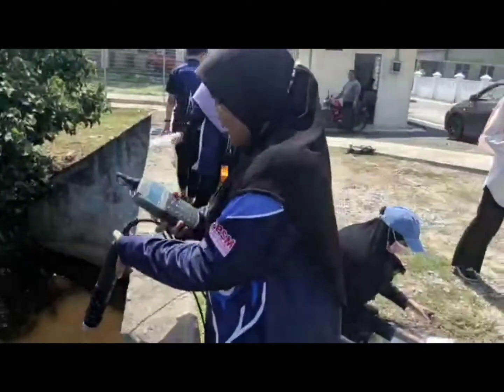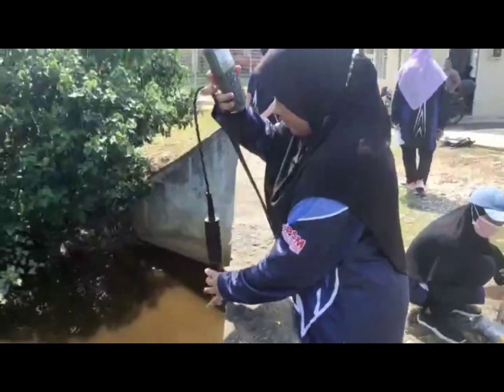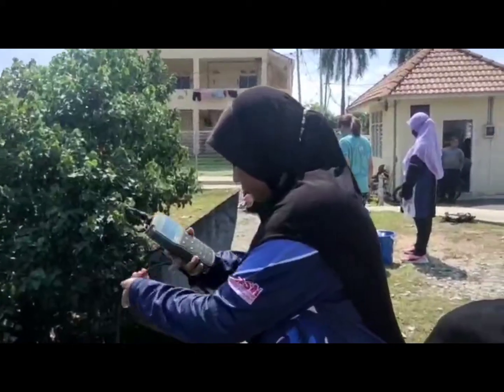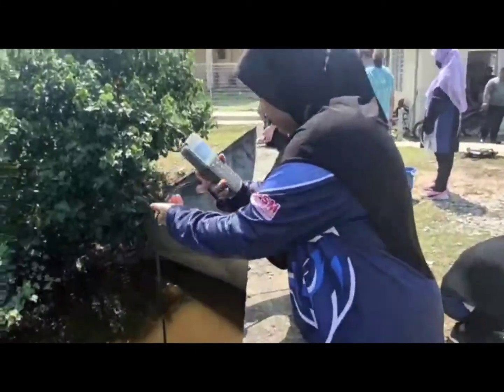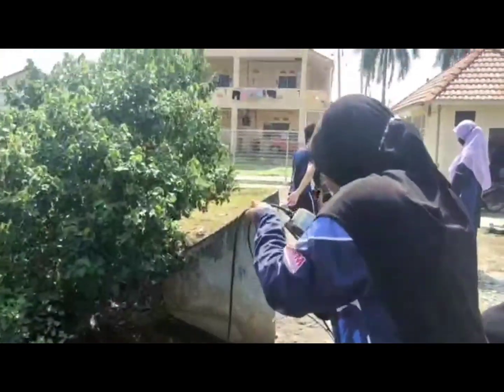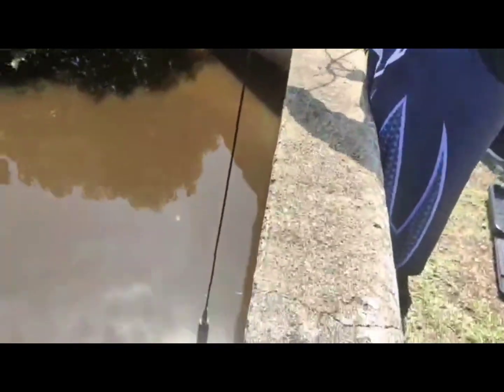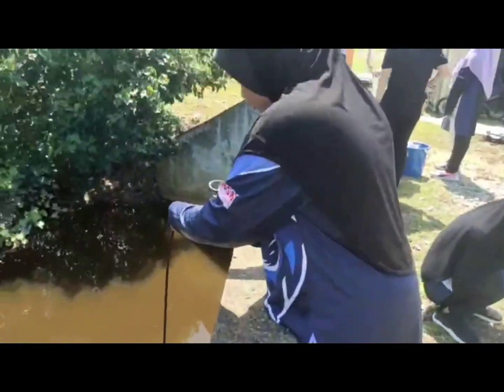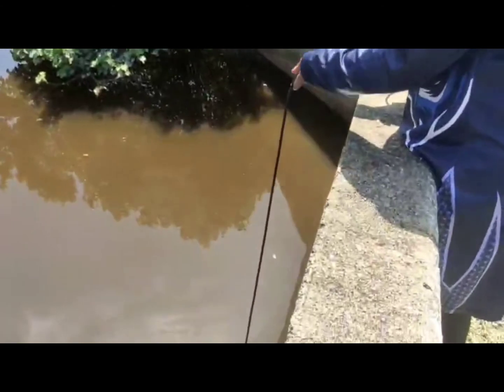Next is methodology. The apparatus we use is only the YSI multi-parameter. First, we switch on the YSI and then the sensor part of the YSI is put into the water body and we wait for 50 seconds. After the 50 seconds, the results like salinity in ppt, DO, temperature, and pH will be shown on the screen, and the results will be captured with a phone camera.